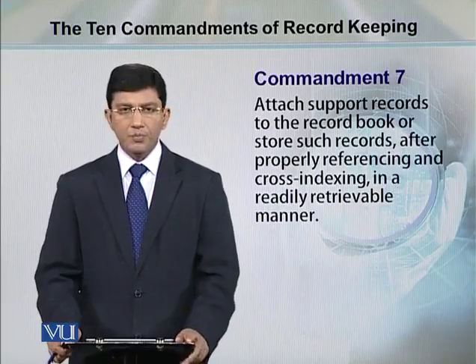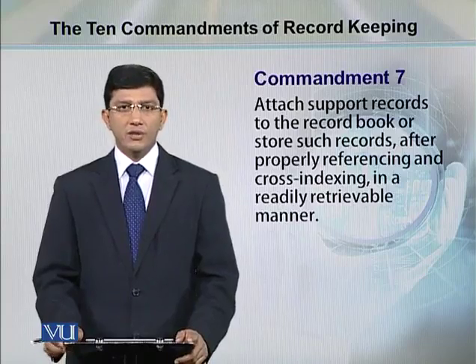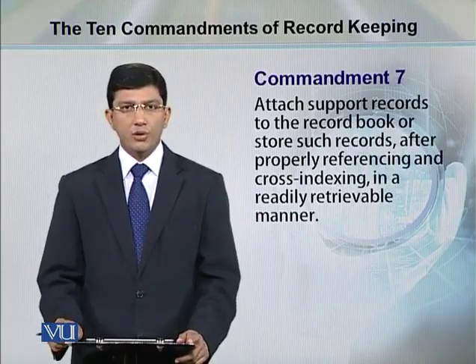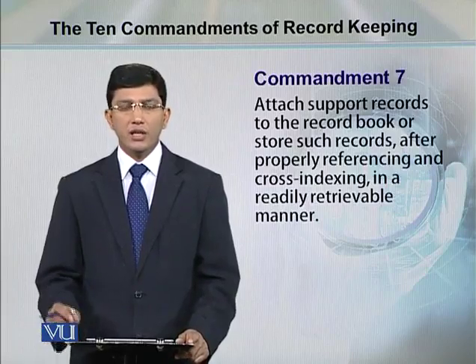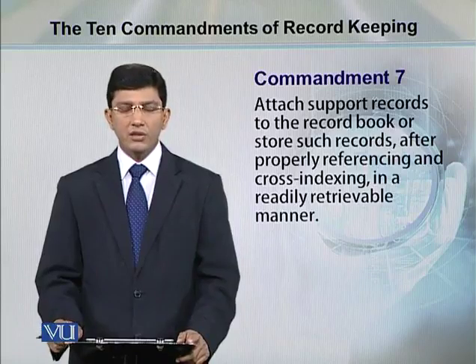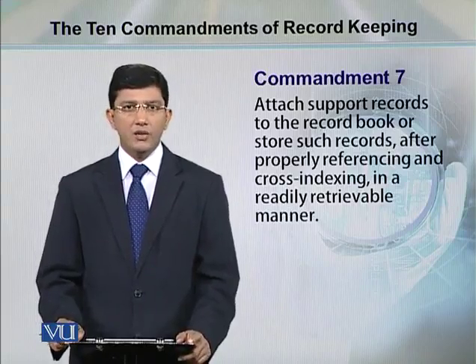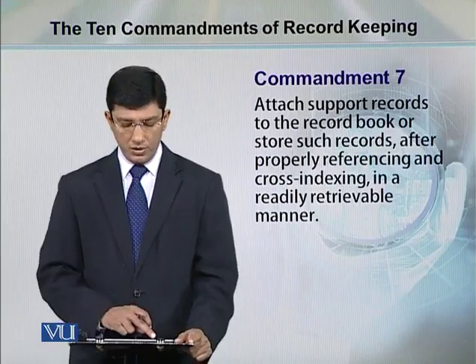Commandment number 7. As we earlier talked, you can refer to your previous experiments in the protocols. You need to give supporting records, a proper reference of the article from where you are taking any kind of material or method, or use the page number from your lab notebook and date of experiment to refer to your experiment in the methods.